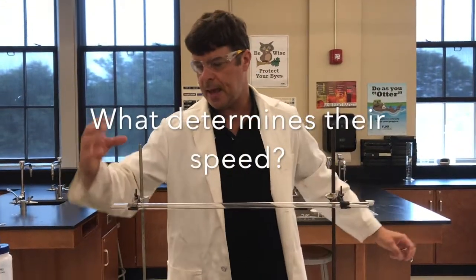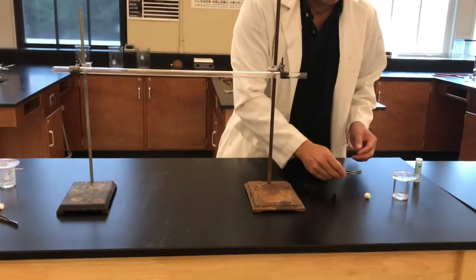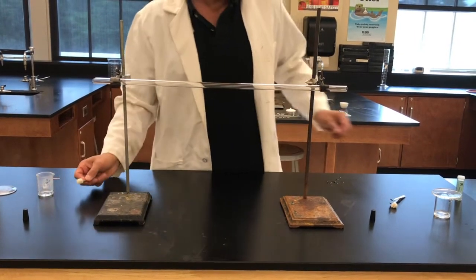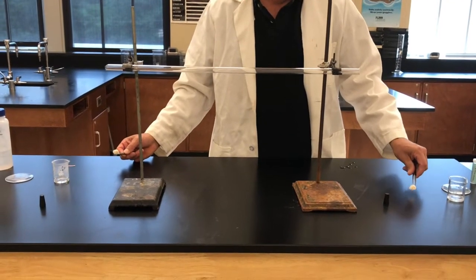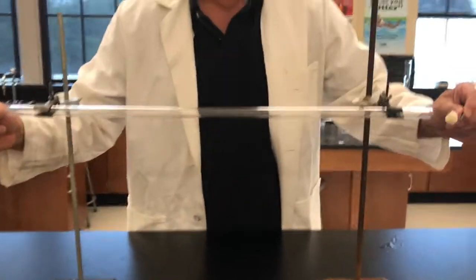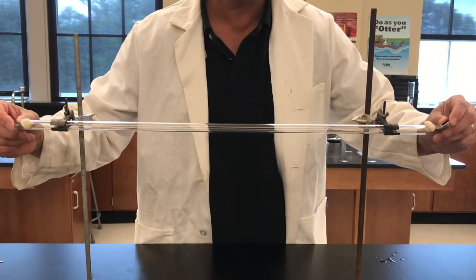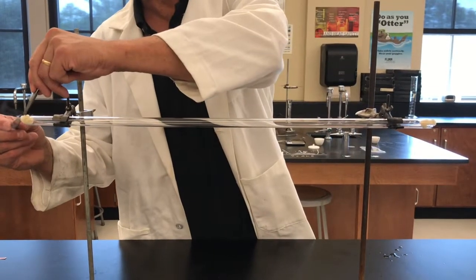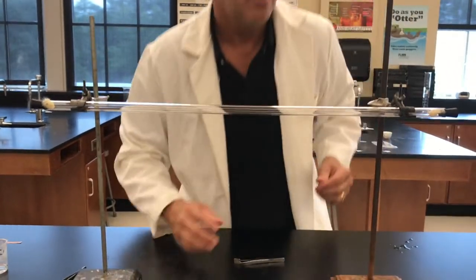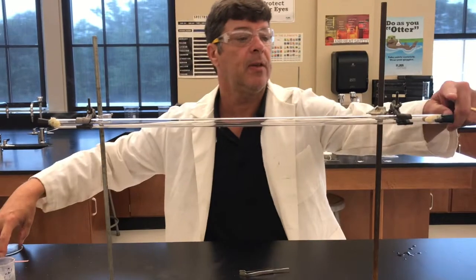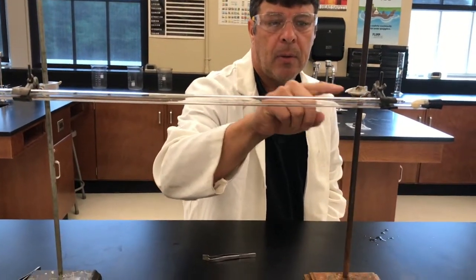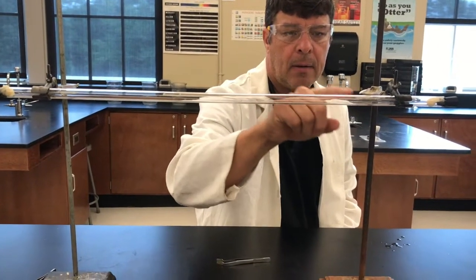Think about NH3 and HCl. Hopefully you've thought about that. I usually have another person do this with me, but I'll try. Don't breathe the vapors. So I'm going to saturate these little cotton balls with the liquids, and at the same time I'm going to put them in. And they're off. I'll put a little stopper there and a little stopper here. Ammonia is on this side, coming off the cotton ball and diffusing through the air — the molecules are hitting air molecules and just moving around.